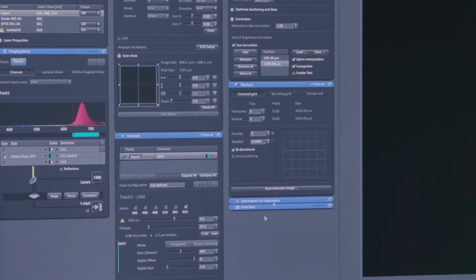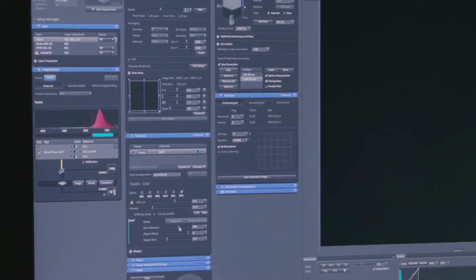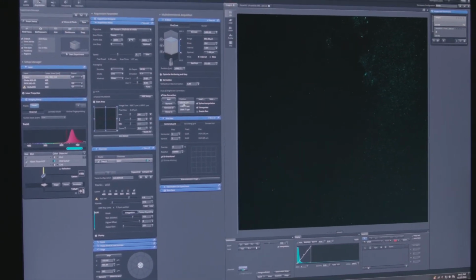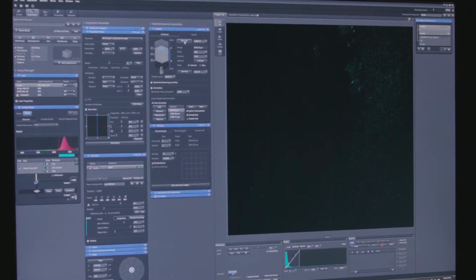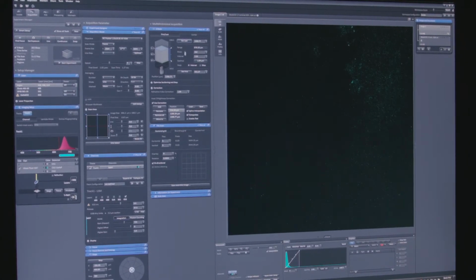So this is the other part. You can increase the laser power and the gain, and then you stop it. You add this as the last Z of interest, and also you can set it as the last Z of scanning of your test. This is one of the tricks that you should know for deep tissue imaging, whole organ imaging. This is very useful, I would say.